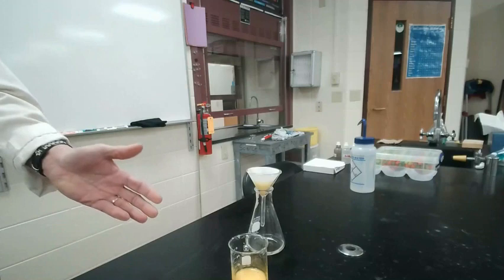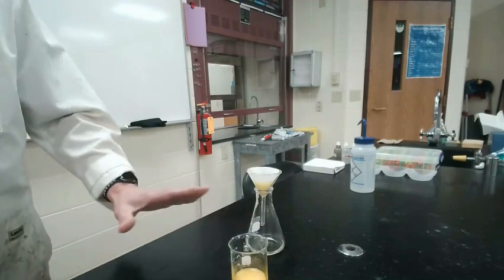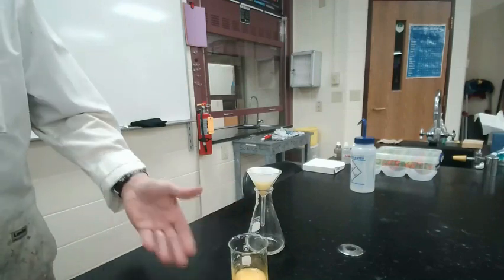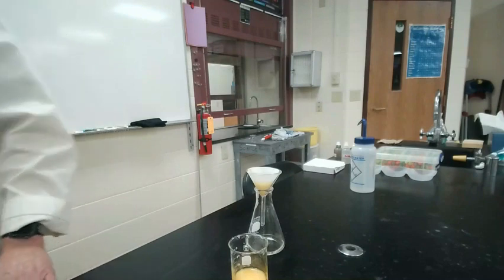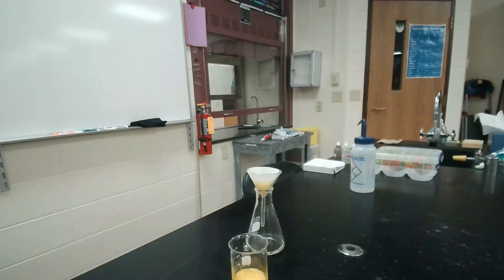So I'm going to stop here. I will finish rinsing this. I'll show you what it looks like before I throw it in the drying oven overnight, and then I'll show you what it looks like tomorrow. But in the actual lab, ladies and gentlemen, where you're watching this video from, I already have the mass of the beaker in there. I have the mass of the filter paper in there. Tomorrow, I will put in the mass of all of this dry, the filter paper, the beaker, the precipitate.